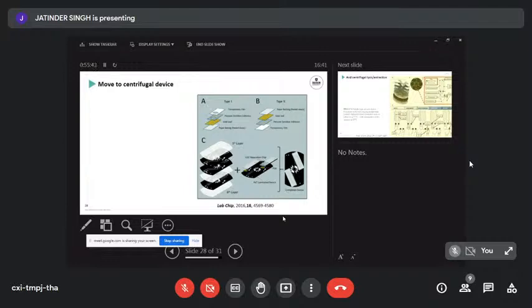They figured out you can also rub it off and make it the electrodes for CE separation. The nice thing about this chip is that it can fill itself with the background electrolyte for electrophoretic separation using the rotation of the disc after they've popped a hydrophobic valve with a laser.